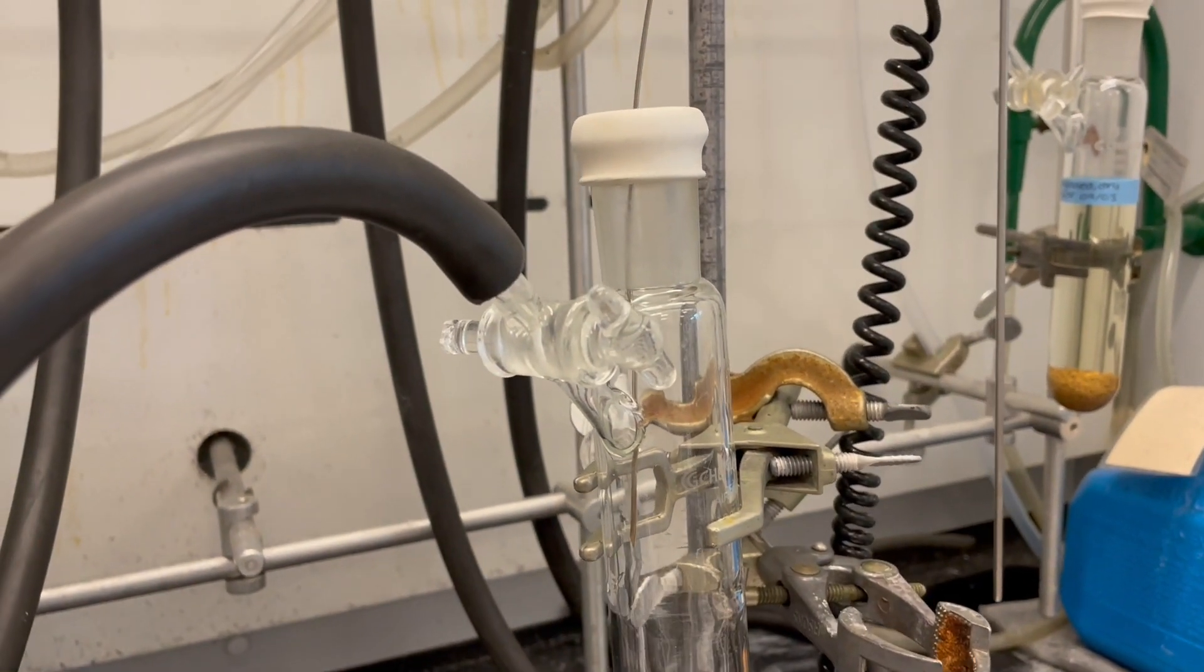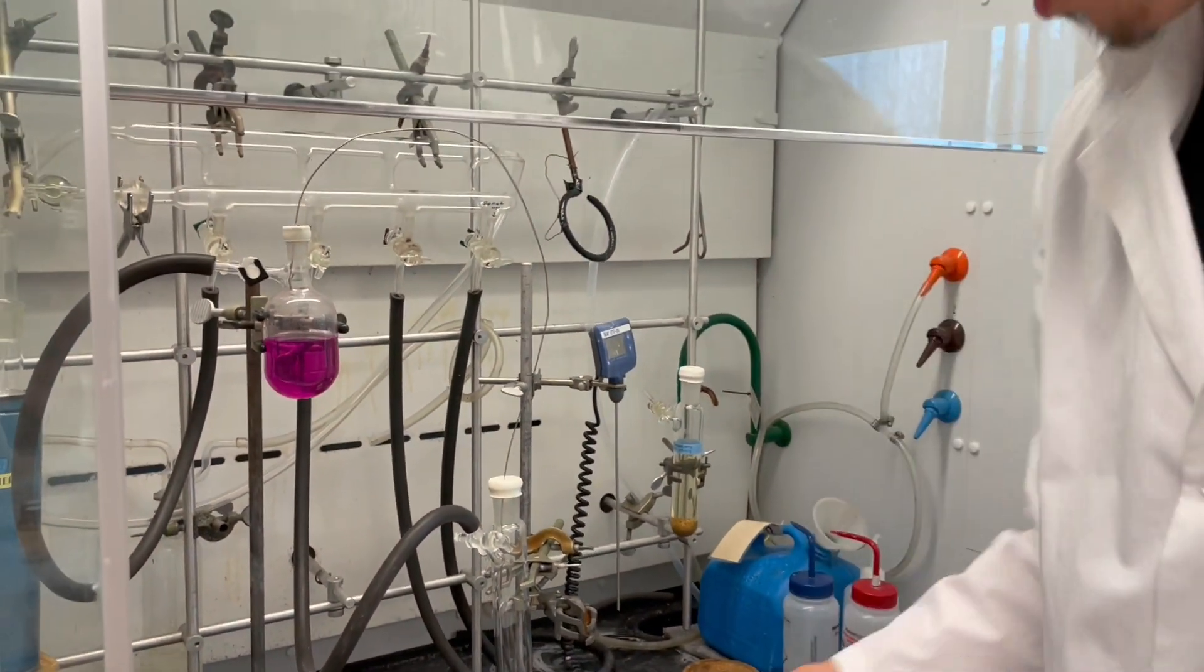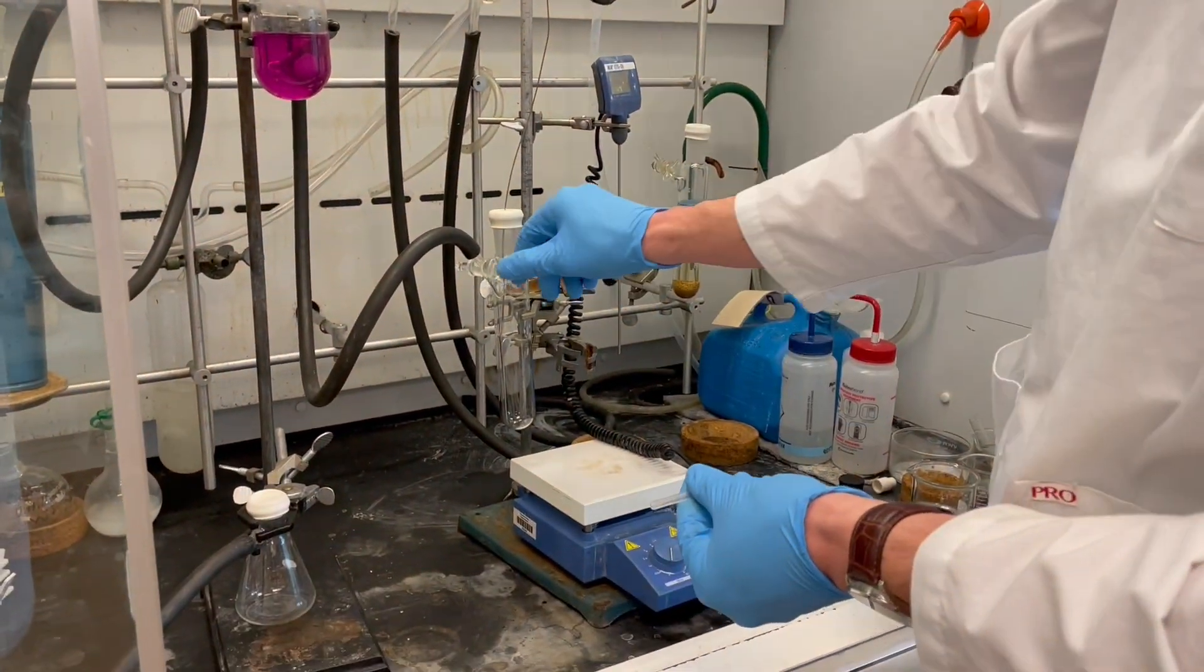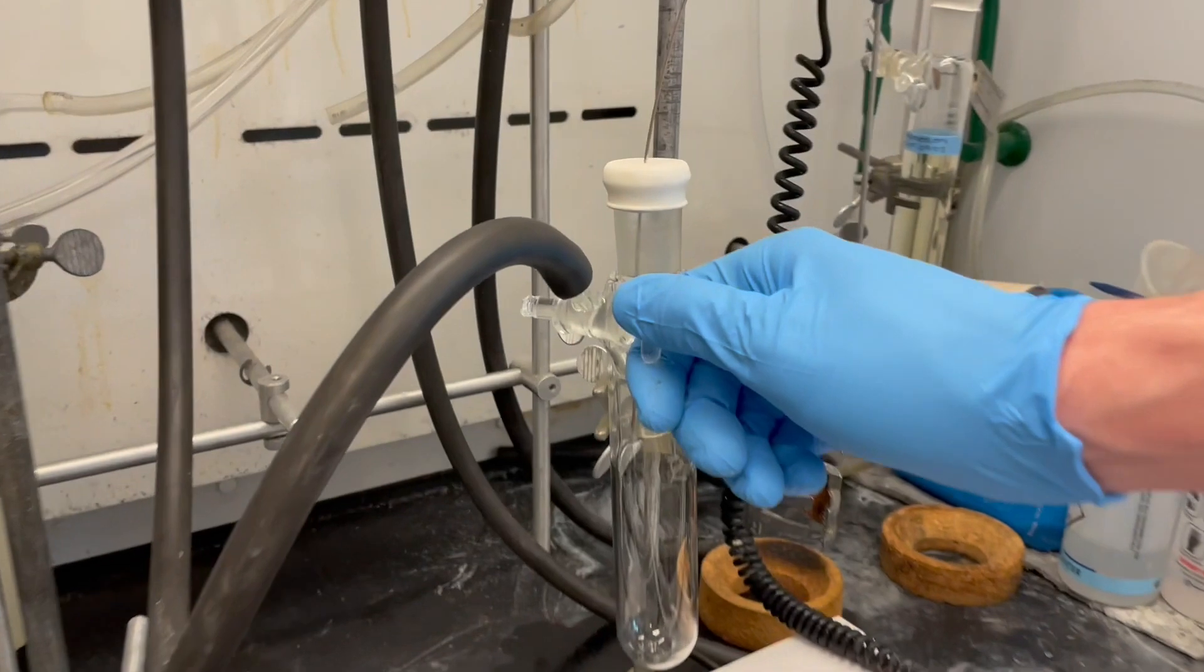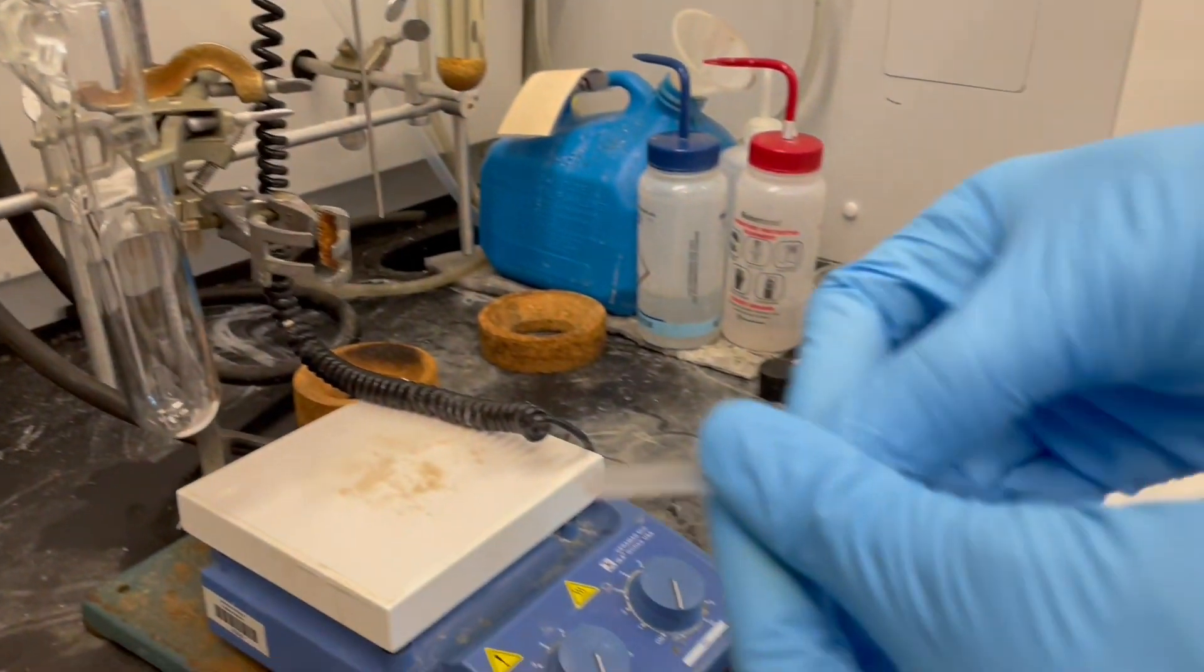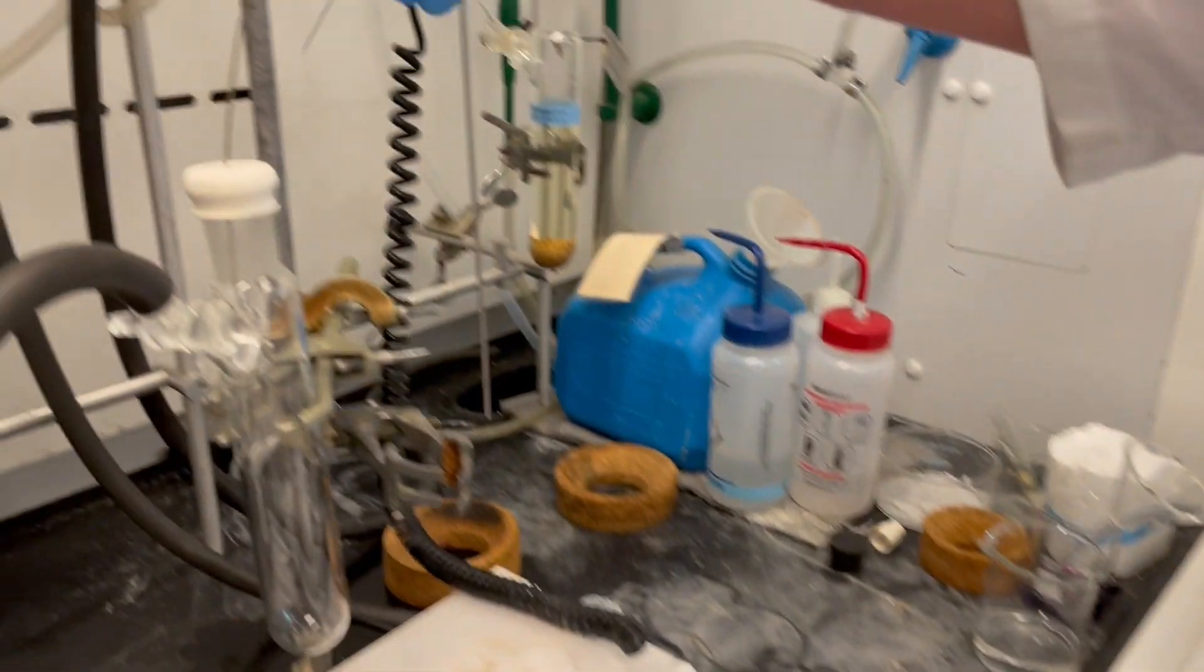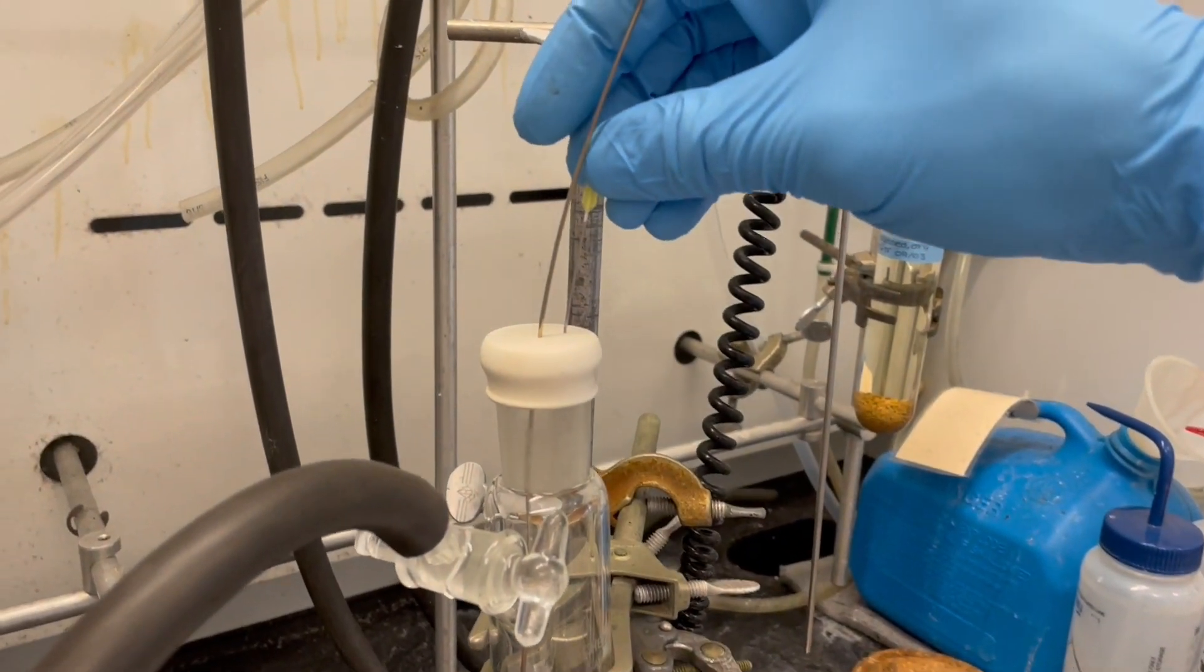As you can see, there's no transfer yet. Now we can close this to the nitrogen. Now we're going to take our bleed needle, go ahead and twist and pull, and insert it into our receiving flask.